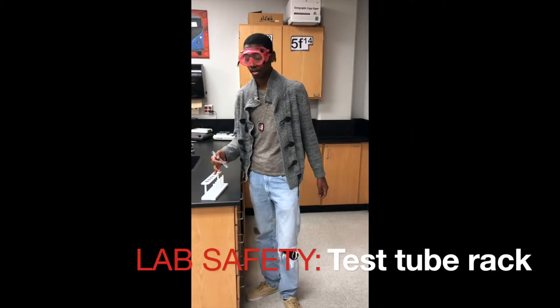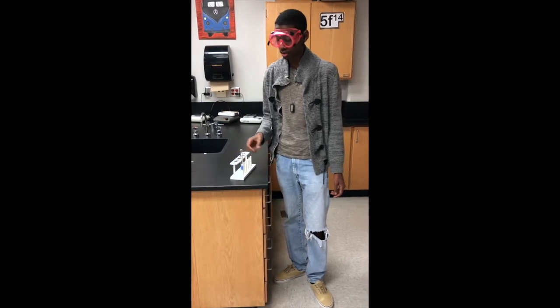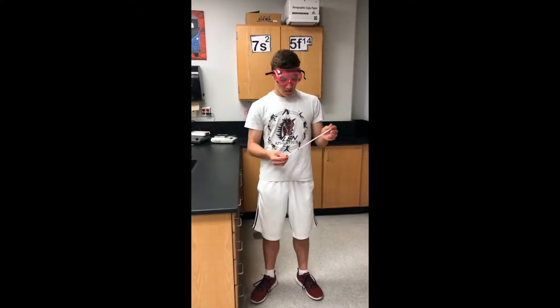This is a test tube rack right here. It is used also to hold chemicals in the test tube, and it's also used after you clean it to dry it off. How we're going to use it is we're going to stick it in the substance. We're going to try to find the temperature of it. And why we use it is to find the temperature of that substance.